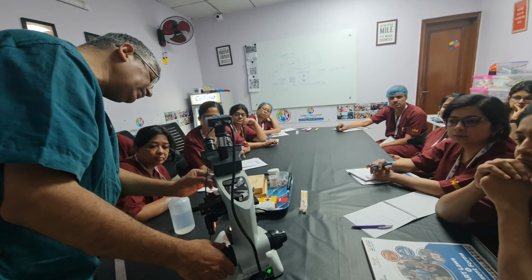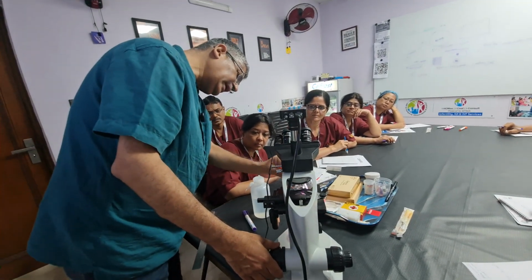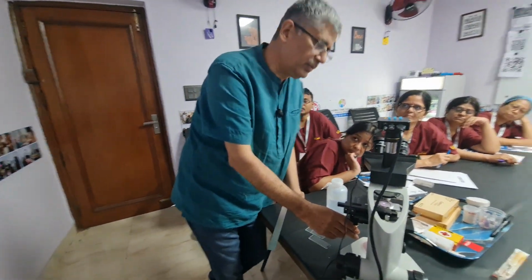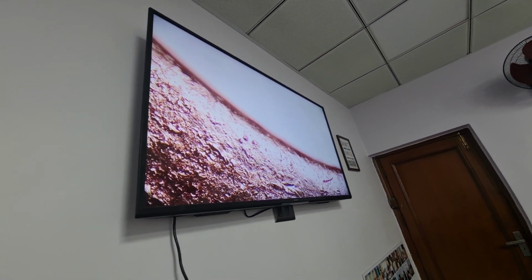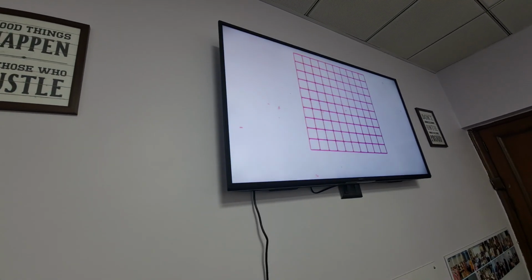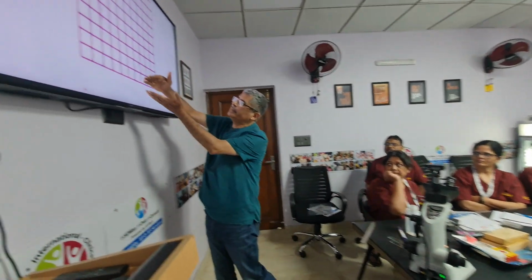So it is okay in case I go to a lower magnification. I go to 4 first. Then there's a chance that I should be able to see my image. I am trying to come to the central grid somewhere. I focus on the central grid. Okay, central grid. I'll try to get some image for you. The light is pretty high. Correct. Okay, now this grid is okay for me when I am at 4x. I want to bring this thing to the center.